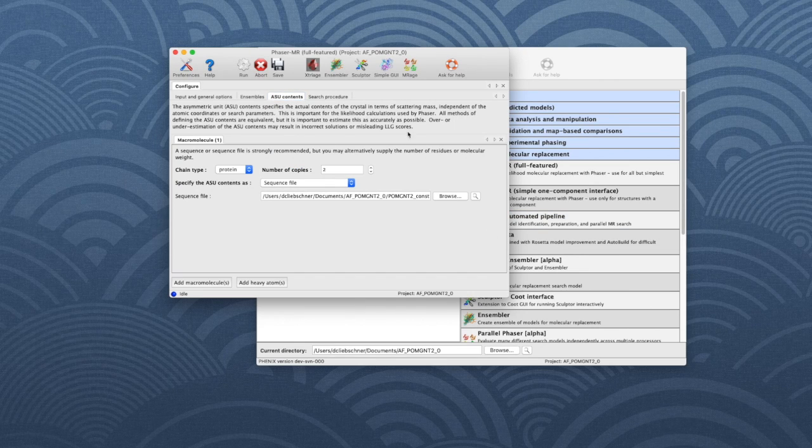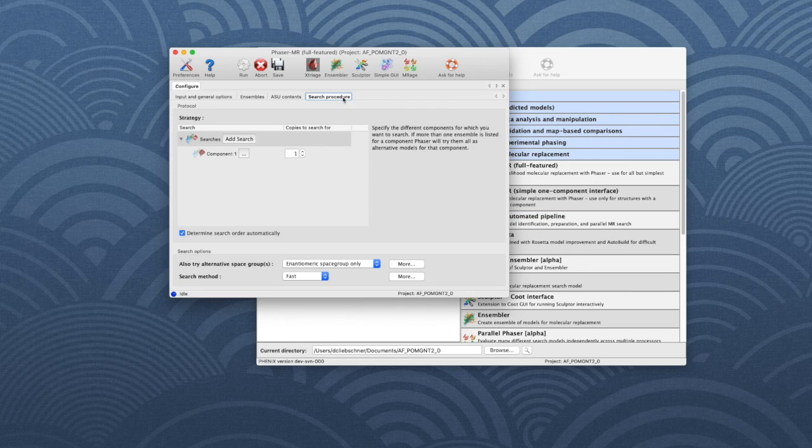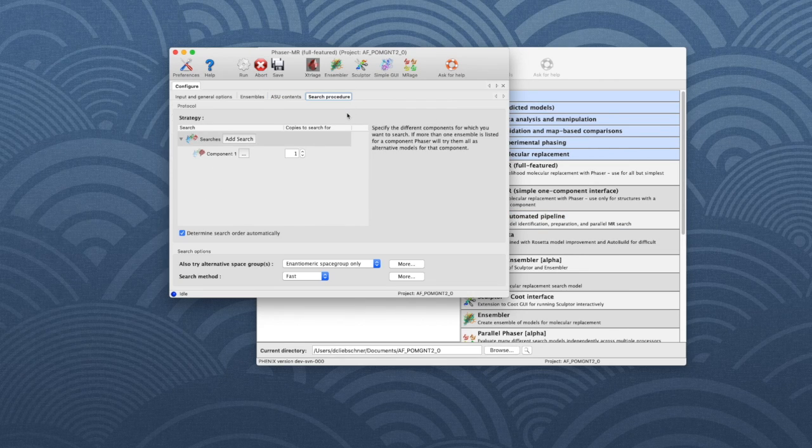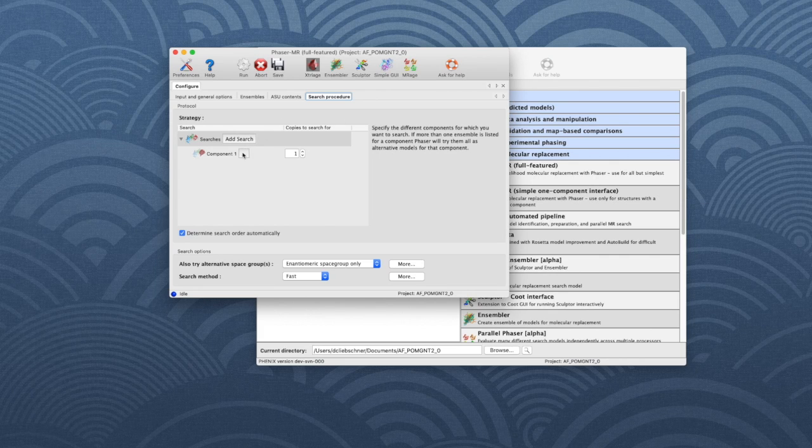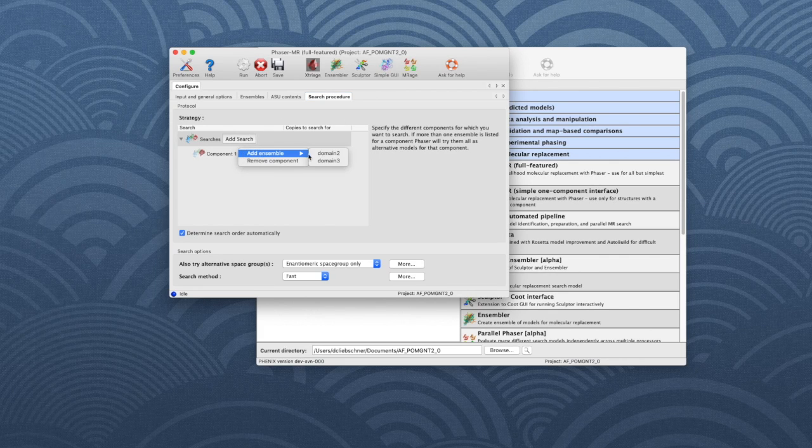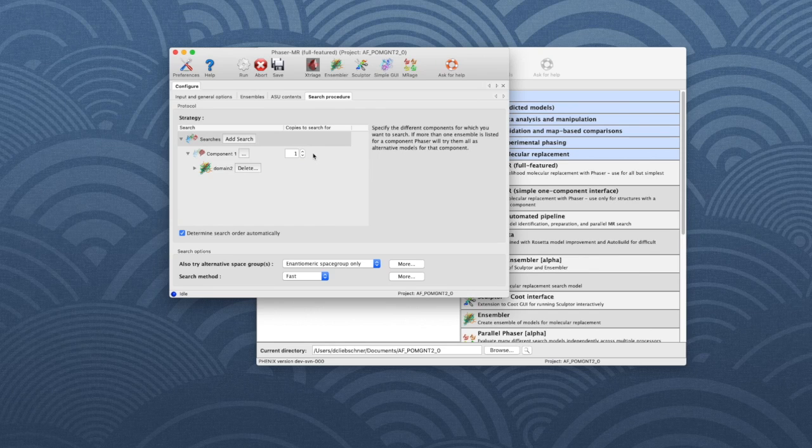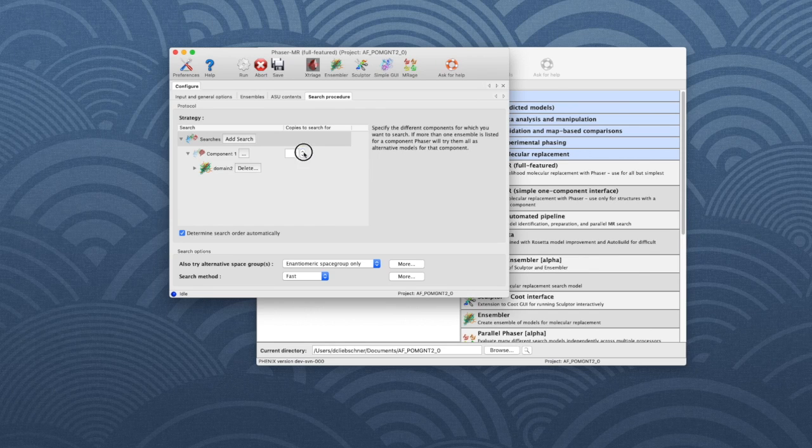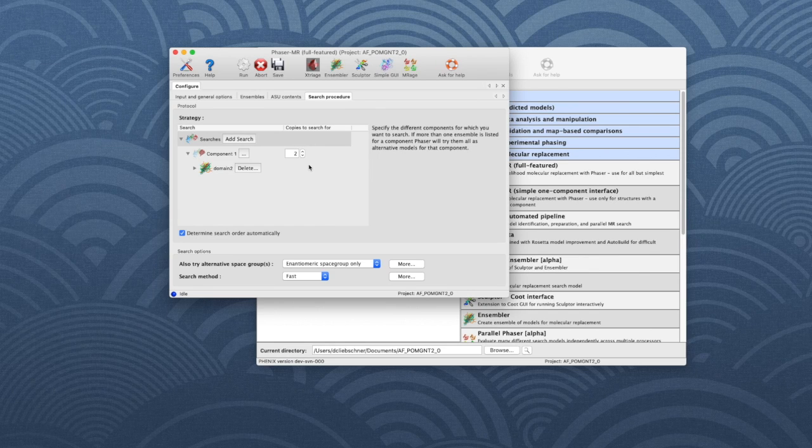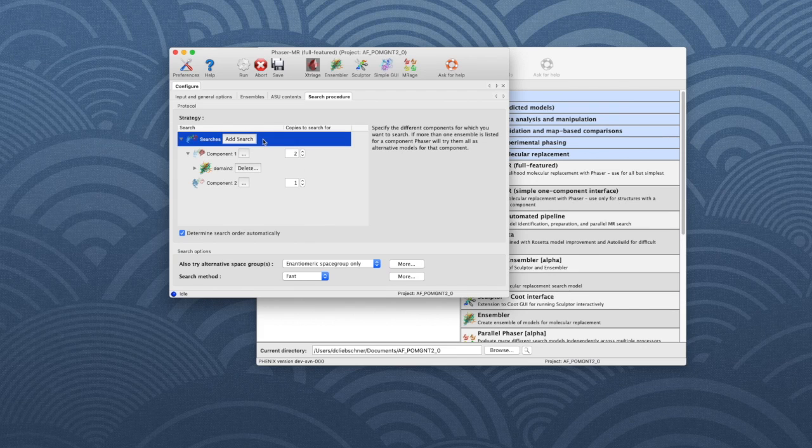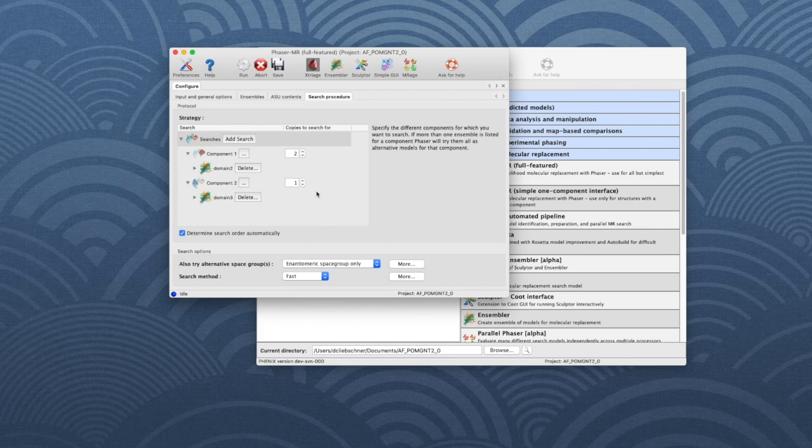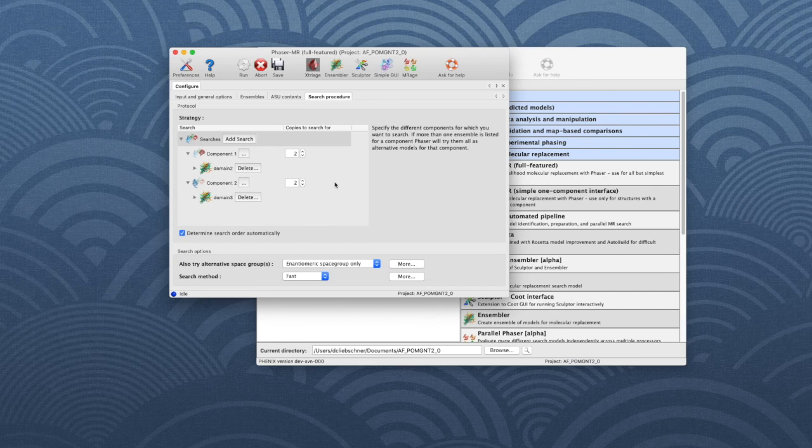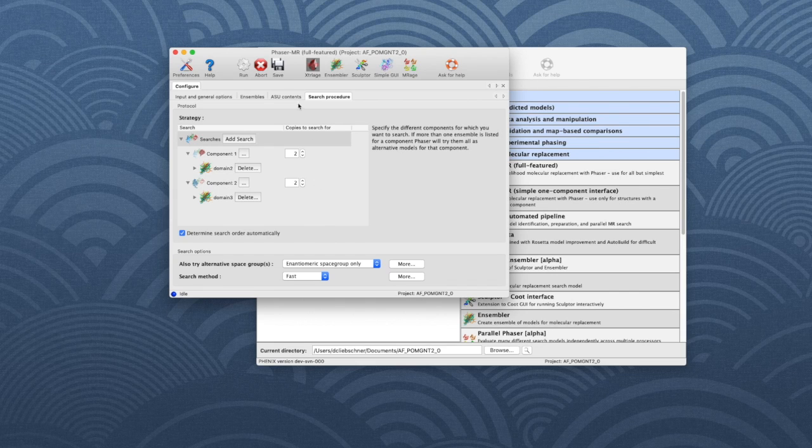In the Search Procedure tab, we tell Phaser how to use the ensembles. Next to Component 1, click on the ellipsis, choose Add Ensemble and Add Domain 2. We search for two copies of Domain 2. To search also for the other domain, click on Add Search and Add a Component. Clicking on the ellipsis, we choose Domain 3 as Second Component. Search for two copies. Click Run to start the job.